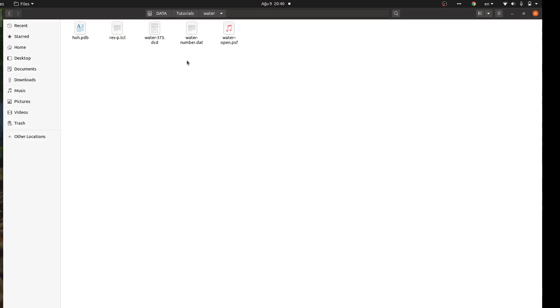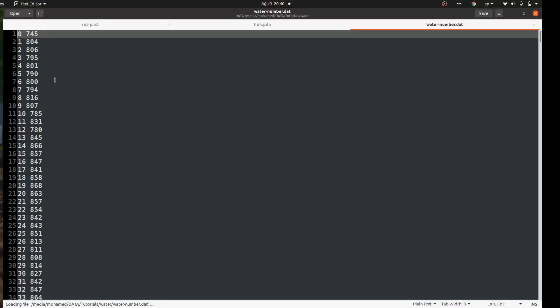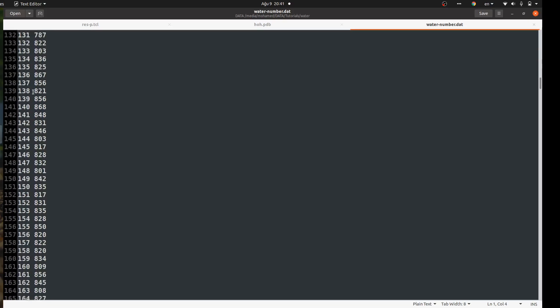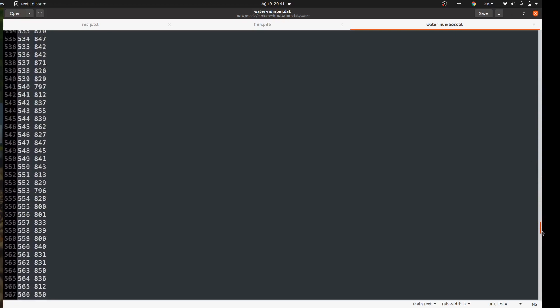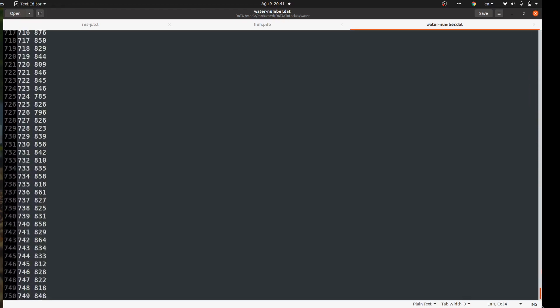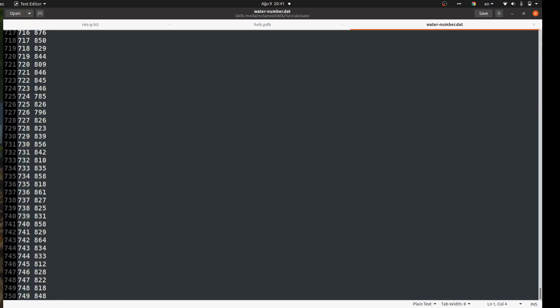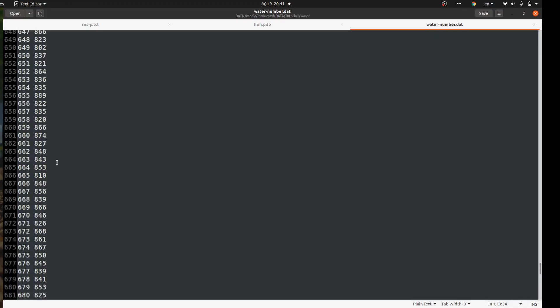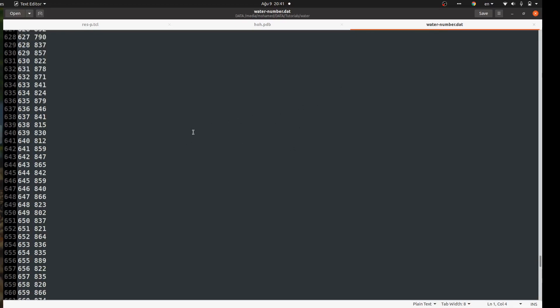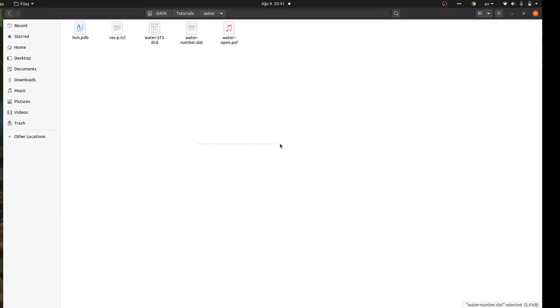It's done. I have the file 'water_number.dat' here. The first column is the frame number and the second is the number of water molecules. You can see the number changes depending on the simulation. It goes up to frame 749 because it starts counting from zero. You can take this data and plot a nice figure of the number of molecules for each frame or nanosecond of your trajectory.